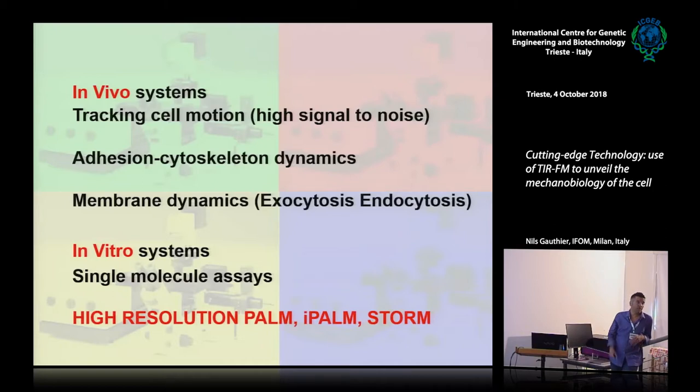Now you can even make cell-cell adhesion with that by mimicking, meaning you start to imprint molecules that are implicated in cell-cell adhesion, and you create a fake or mimicking system of cell-cell adhesion, and the cell will start to develop cell-cell adhesion with the substrate directly, rather than a cell.